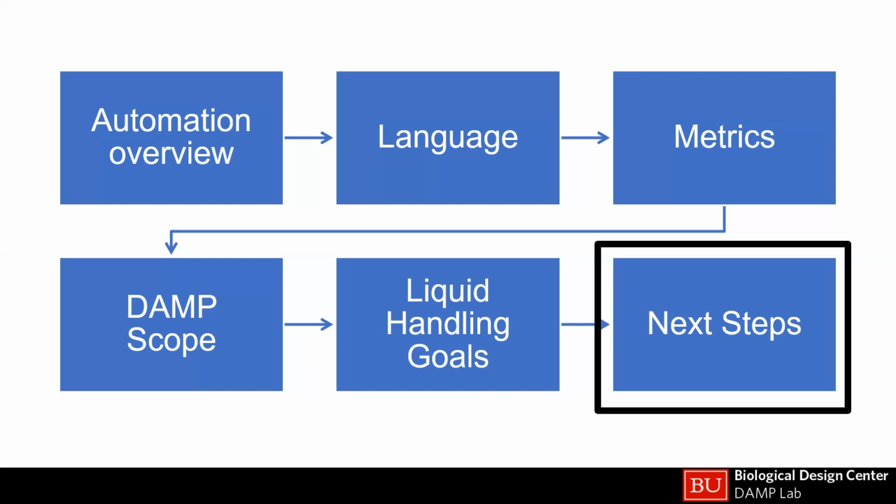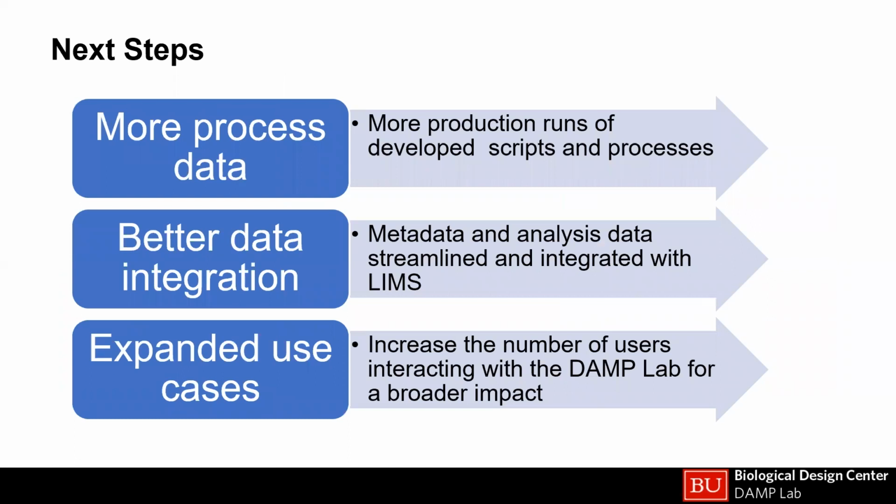But aside from that, zooming back into the liquid handling, the next steps that I think we can work on are having more data around these processes, just more instances of runs to validate that they're still working, fine-tuning things as we need to.